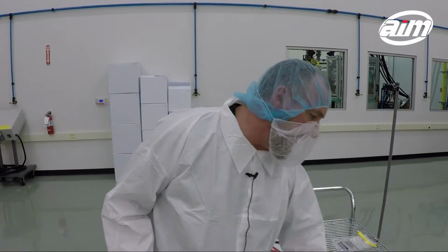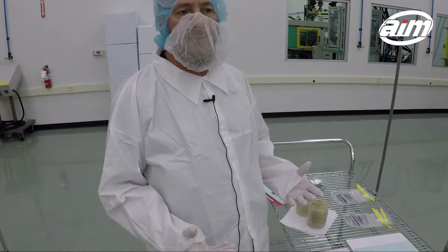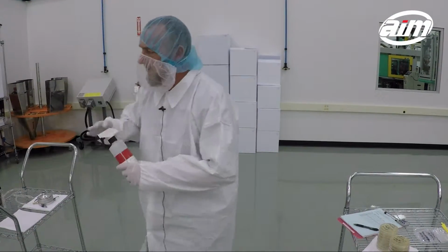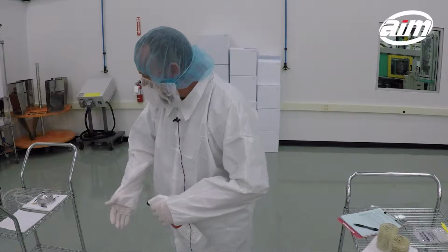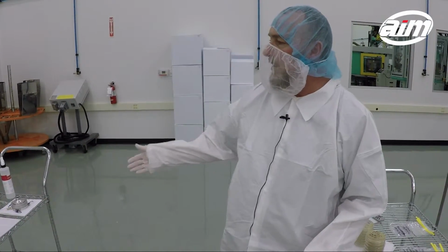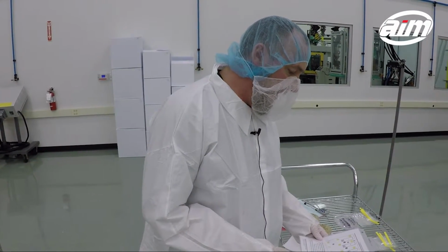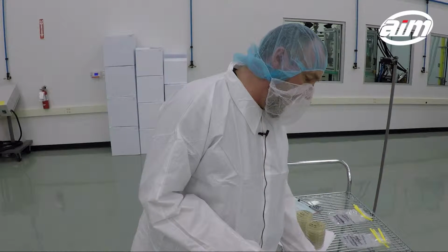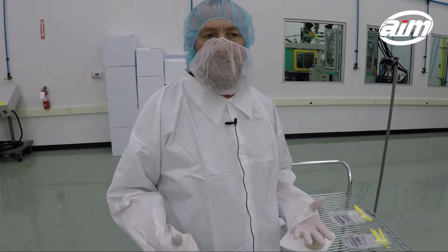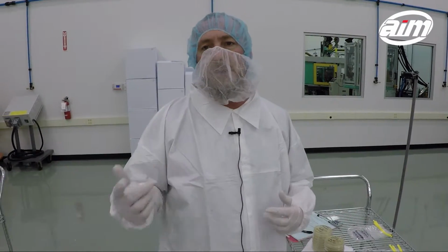I'm going to start with a sample plate for the bacterial sample collection. So what I'm going to do is sanitize my hands with 70% isopropyl alcohol. I have the impactor in a location according to a sampling location map that I've put together for the collection of the samples. For the viable air samplings that we're doing, we're doing 8 locations in the clean room, including 6 in the main clean room, 1 in the gowning room, and 1 in the transfer room.